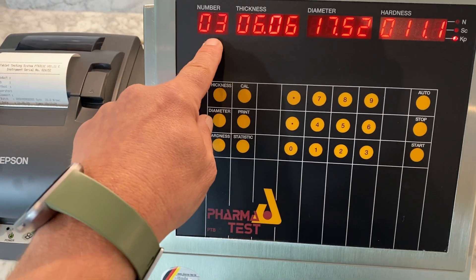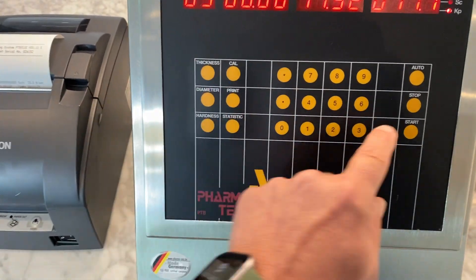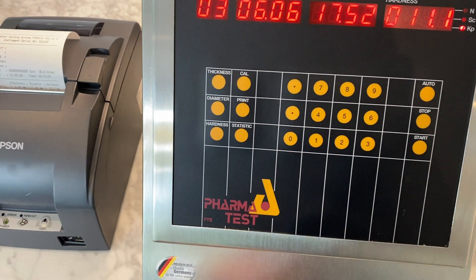We would then test the total number of tablets in our test, whether they be 5, 10, or 20. To stop the test and get the results, we press stop.